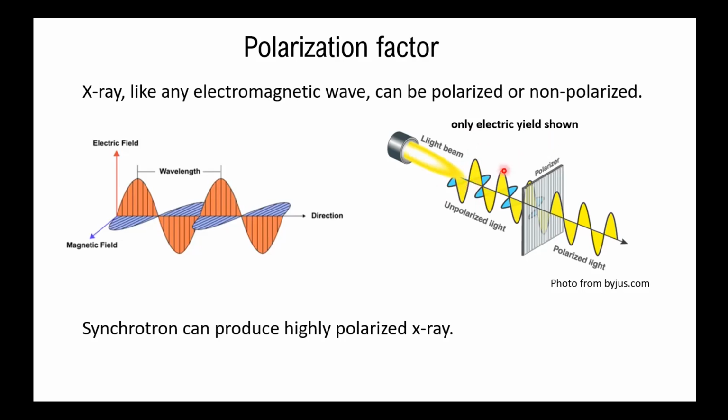If you have a polarizer, this can be something like the sunshades you can buy from shops, and some sunshades have a label saying polarized on the shades. They will cause some polarization of the natural light, or it can be caused by some typical solutions of chemicals, right? In chemistry, we learn how chiral structures can give rise to directional polarization of the light, right?